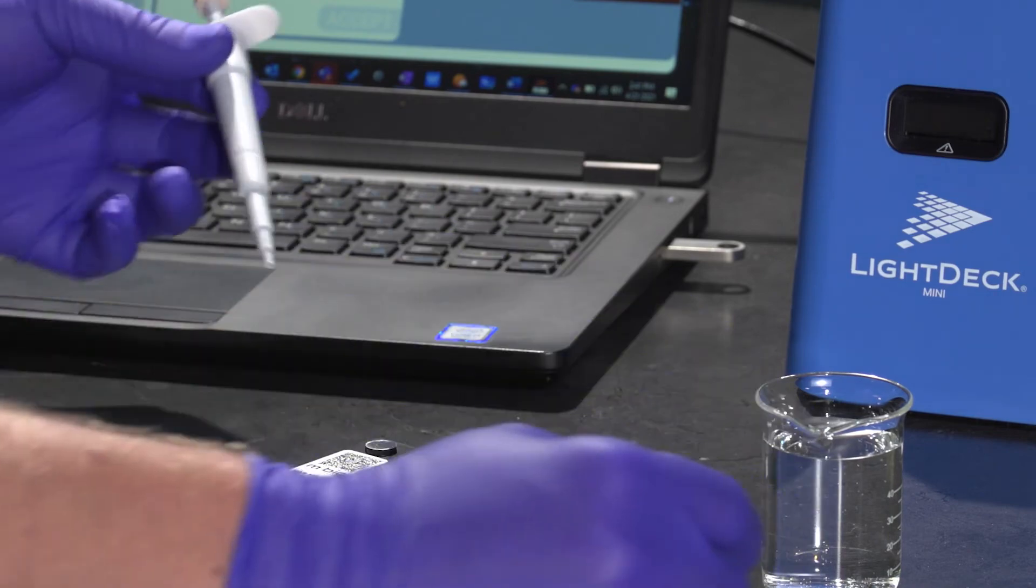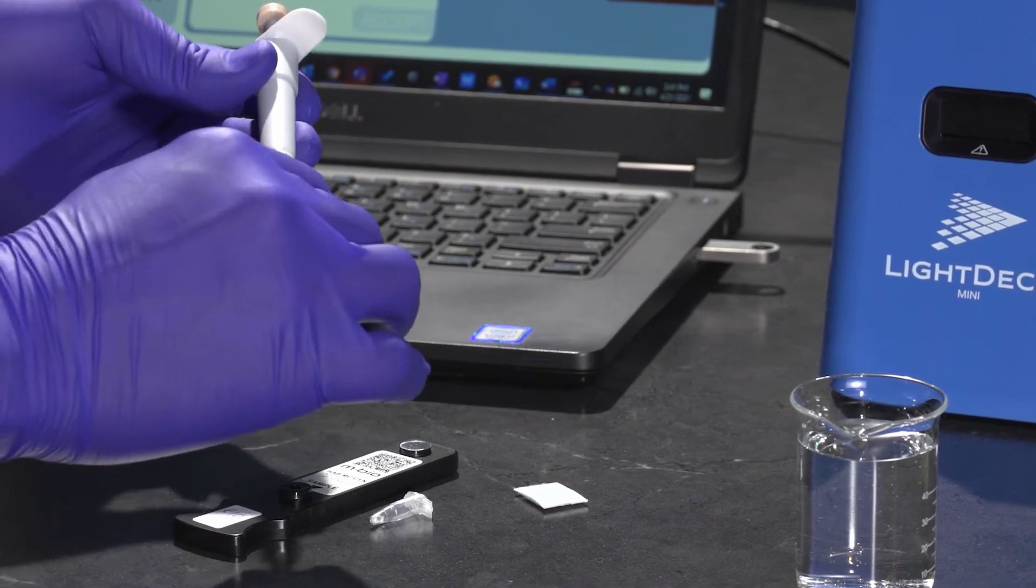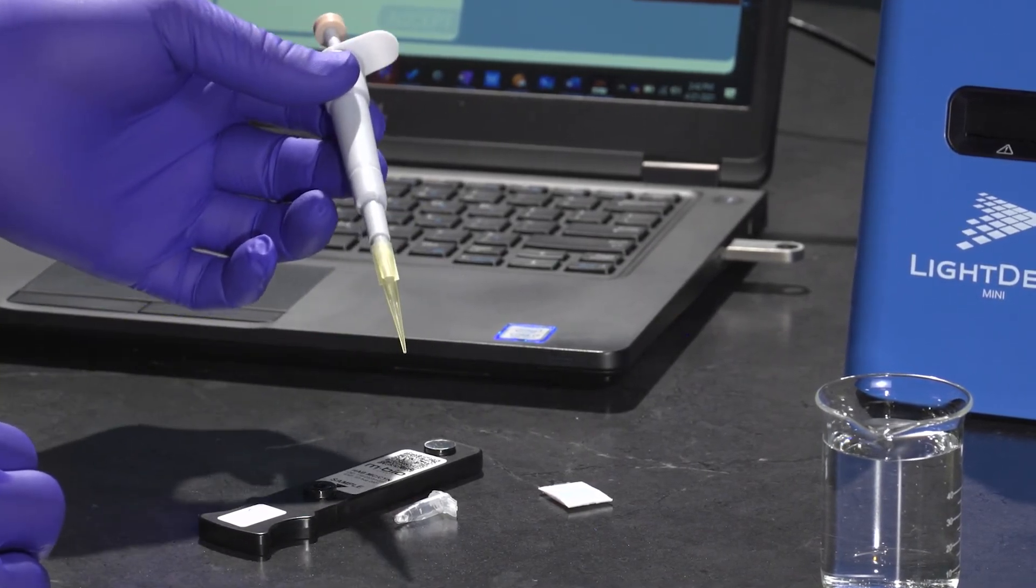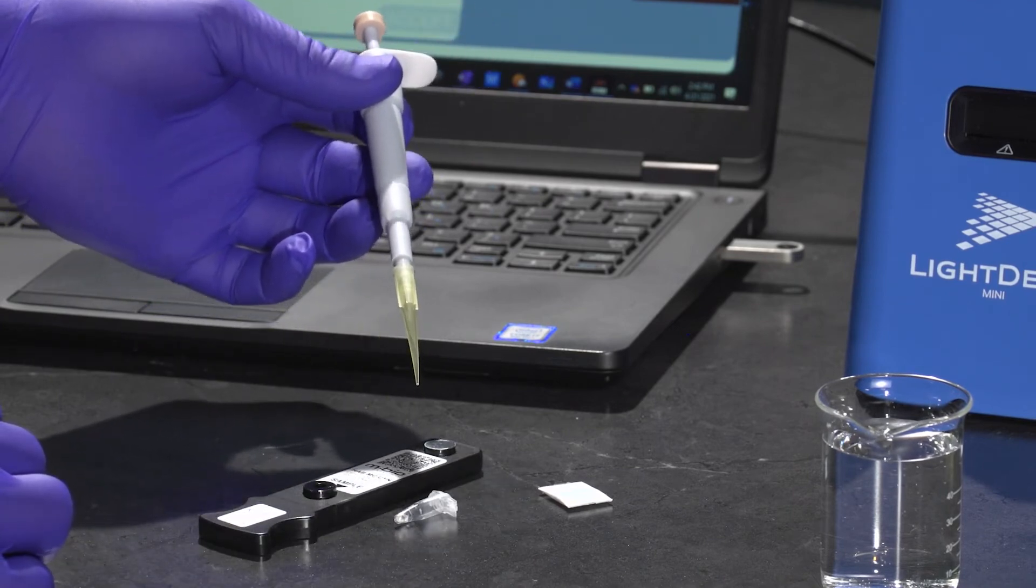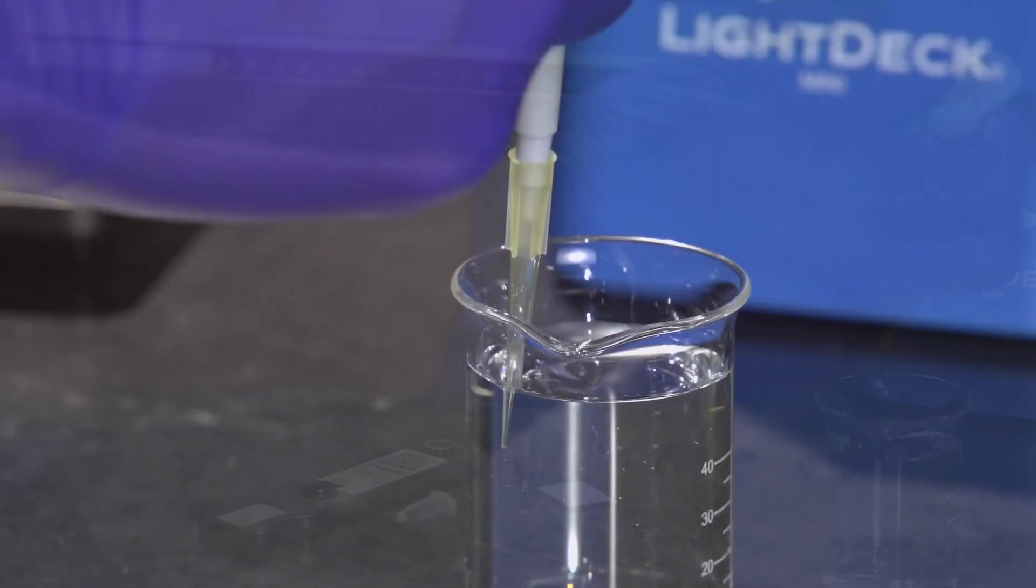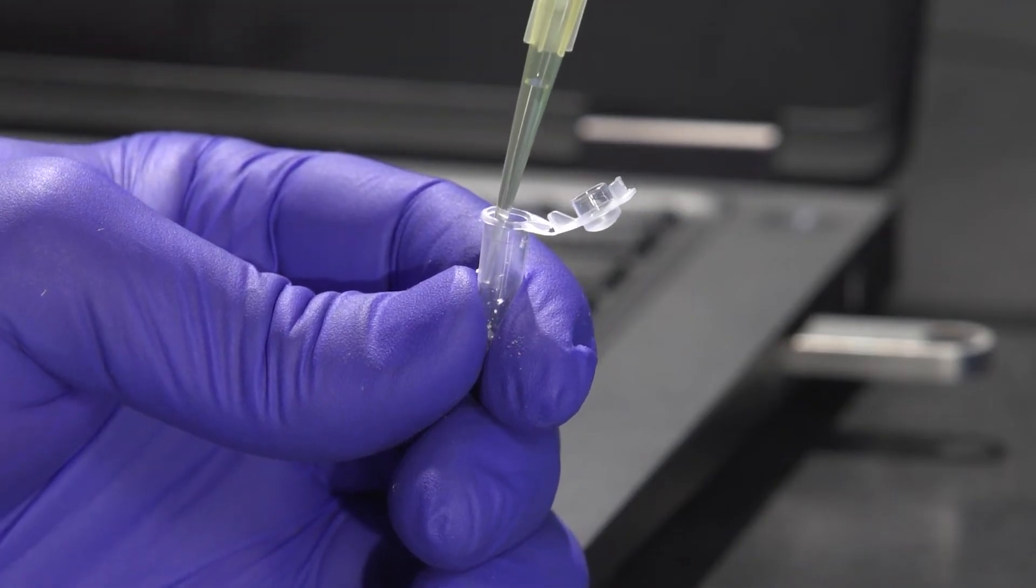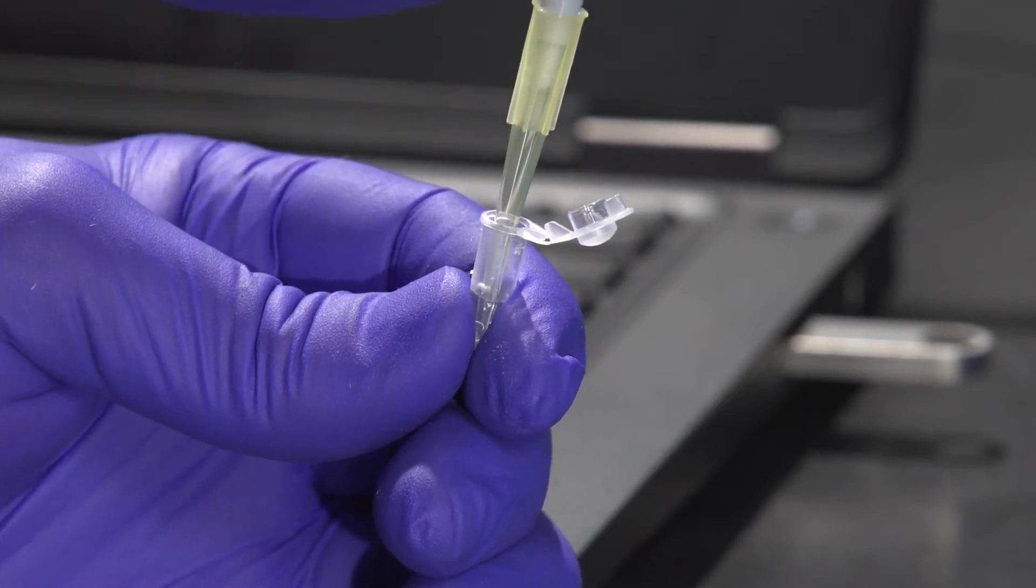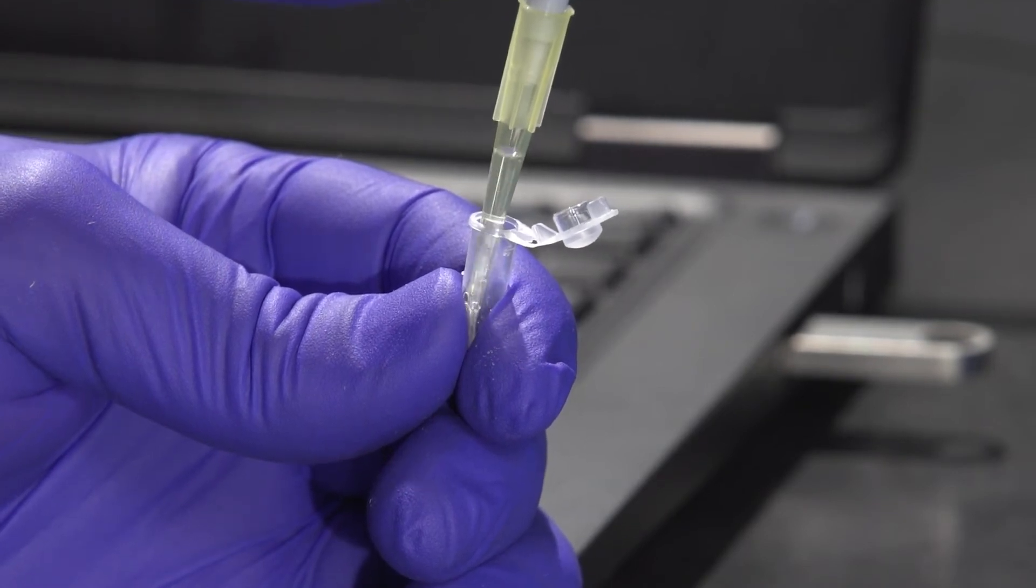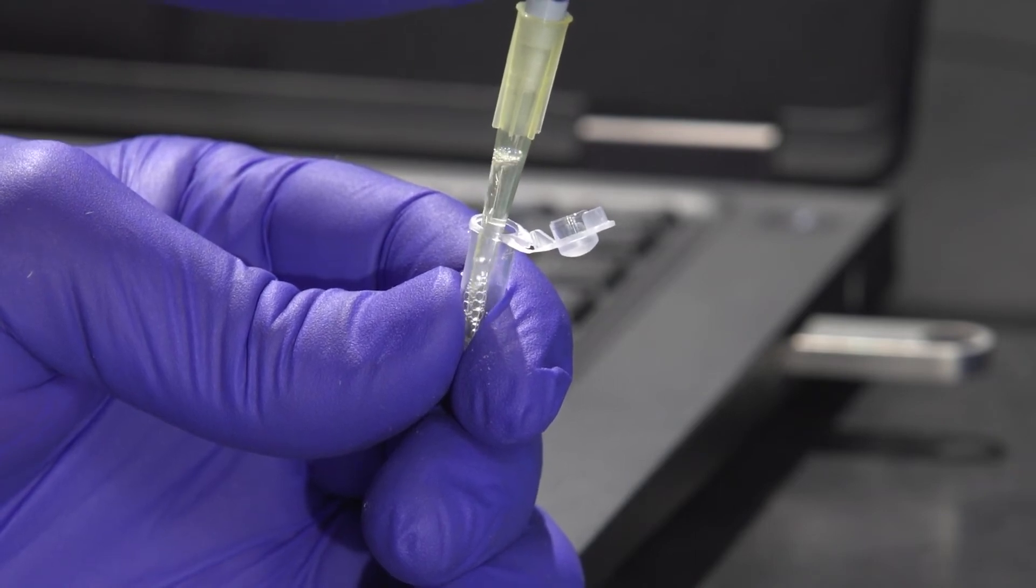You're going to take the 100 microliter fixed volume pipette, put on a new pipette tip, and then transfer 100 microliters of sample into the tube with the reagent. Once that sample has been introduced into the reagent tube, we're then going to use the pipette tip to mix that sample 10 times by aspirating with that pipette. So we're going to go ahead and mix that 10 times, keeping all of it within the reagent tube.